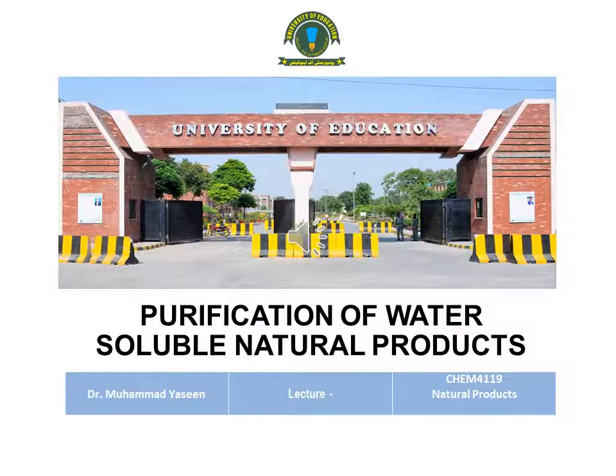My dear students, I am Dr. Muhammad Yasin from University of Education, Raslabad campus. Today we are going to discuss purification of water-soluble natural products. So our emphasis will be on the isolation of the natural products that are soluble in water.